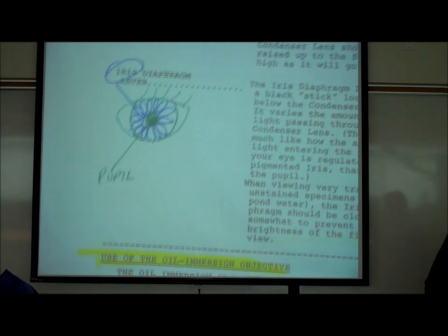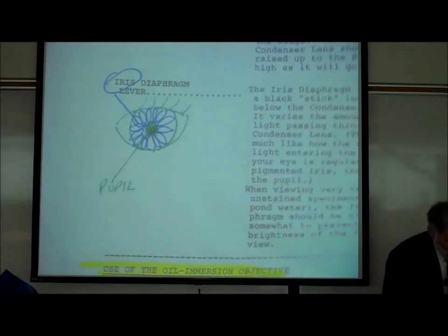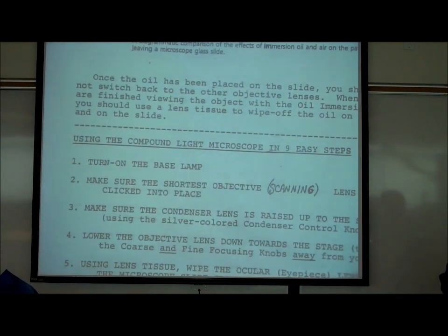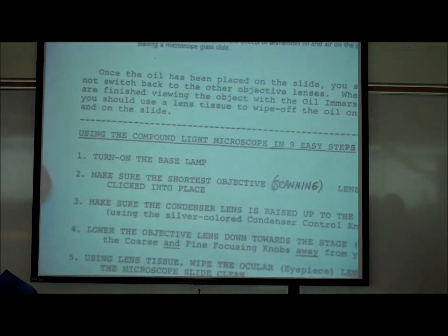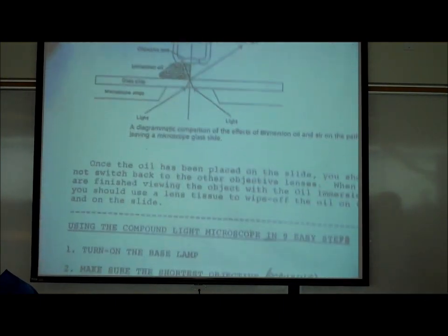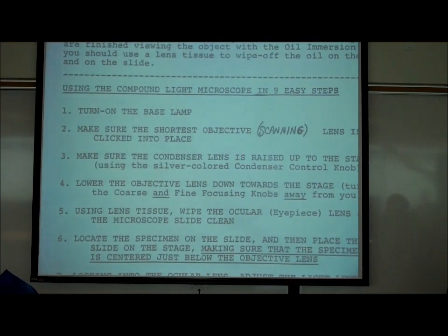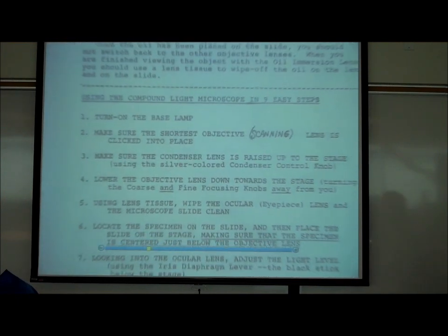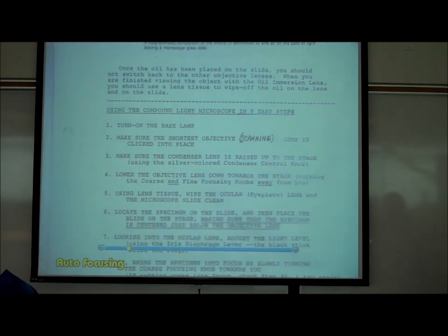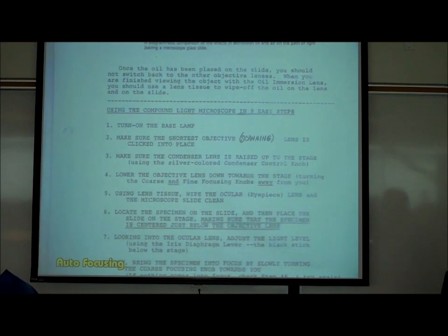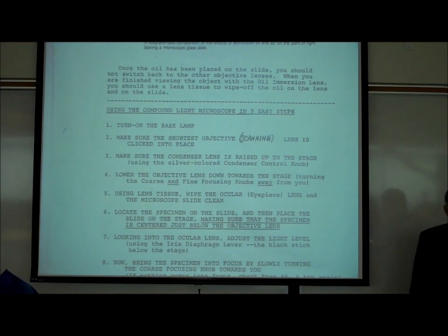That's how the iris diaphragm lever gets its name. On page B9, I've summarized how to use the microscope with a number of steps to follow.